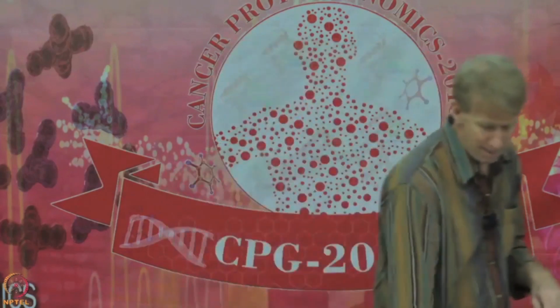So in cases like this, and it's going to be often the case that if you have to determine between two choices that are right next to each other, you're going to have to make that decision on maybe one or two peaks in the spectrum. All right. Let's talk about the range of possibilities that could happen here.